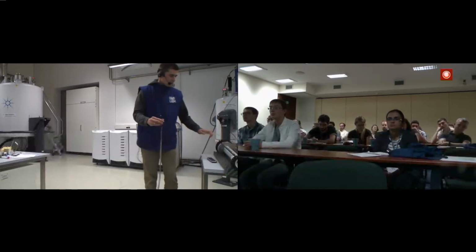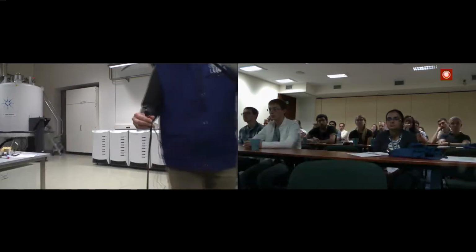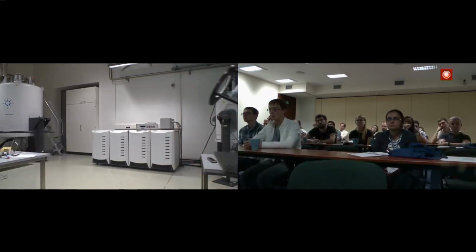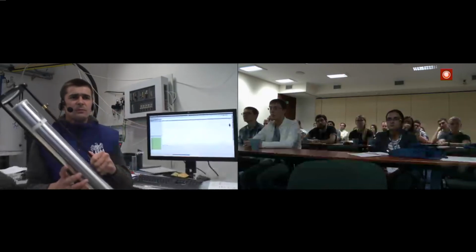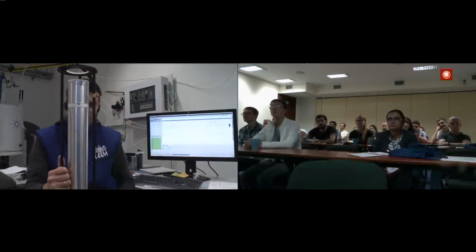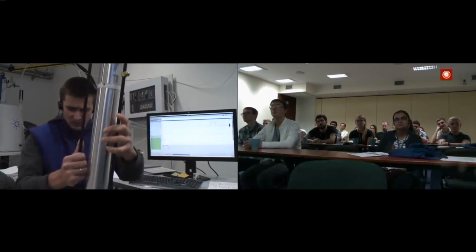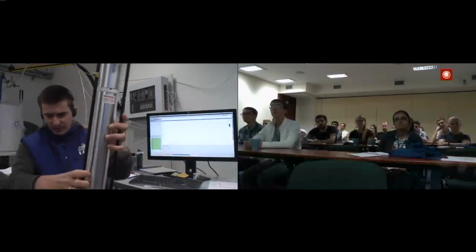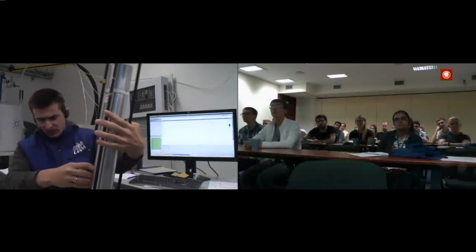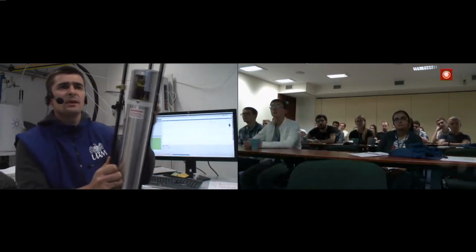I'd like to show you several interesting features about that probe head. So let me magnify the screen here. Yeah, so that's the probe head. Zbigniew has already presented several pictures, but I would like to show you how the stator looks, and that its position is not coincidental.